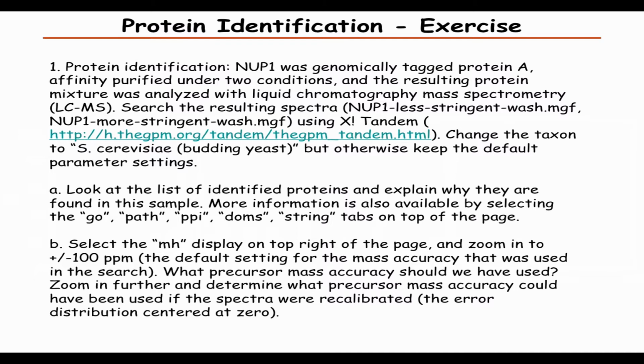And did anyone see sheep keratin? And so what is that from? Sheep keratin. Wool. Yes. Wool sweaters. That one you always see a lot of also. So it's a good idea to try to minimize these things, but definitely you'll always see those things.